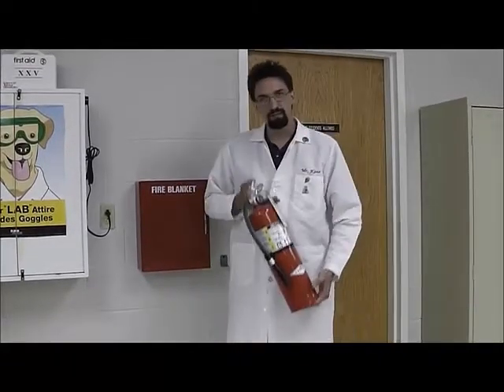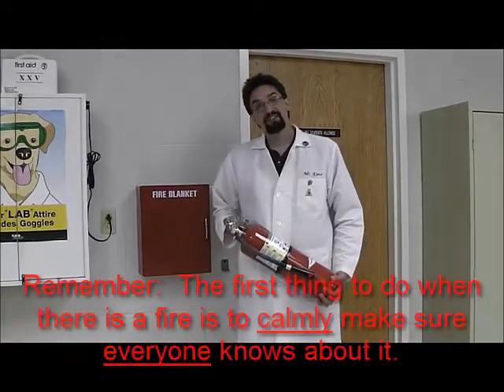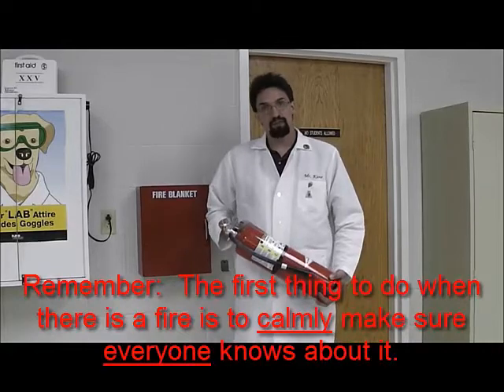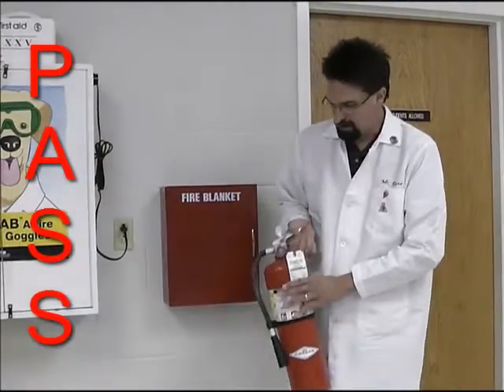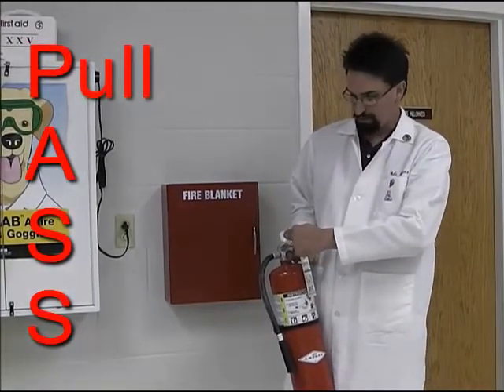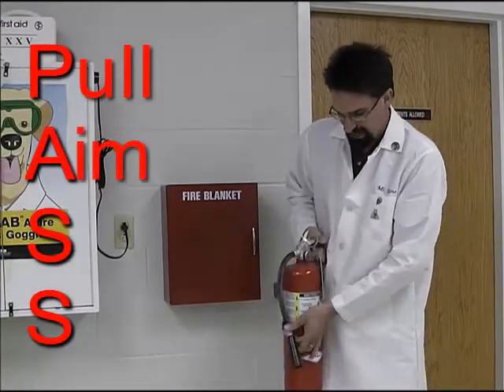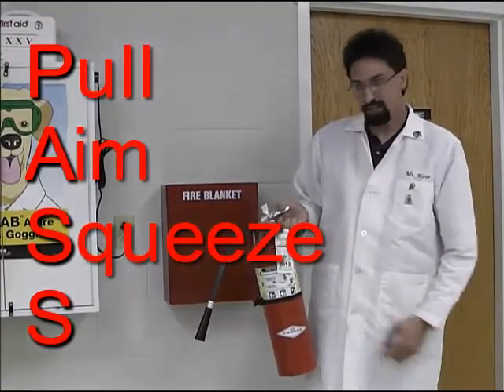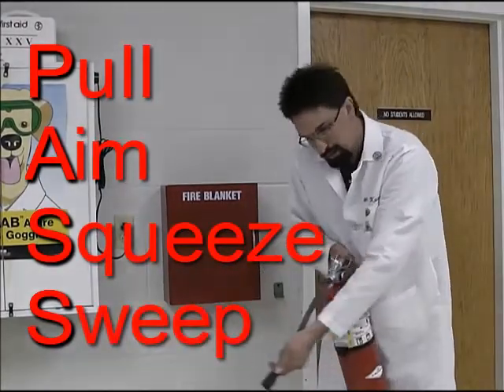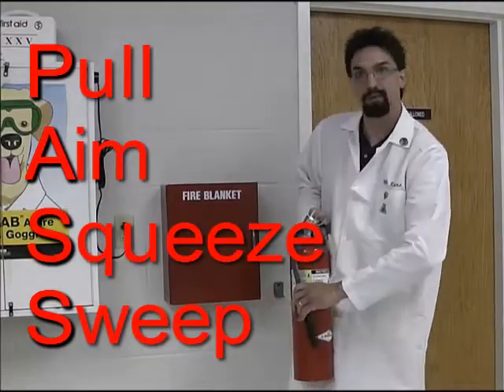You just pick it up and pull it. It is pretty heavy — probably about 15 pounds. If a fire starts in the lab, the best thing to do is first make sure that people know there is a fire, and then one person should walk to get the fire extinguisher. Typically that will be a teacher, but if the teacher is not available, it might wind up being a student. To use a fire extinguisher, remember the simple acronym PASS — P-A-S-S. The P stands for pull — you pull the pin. A stands for aim — you aim the hose at the base of the fire. S is for squeeze — the handle needs to get squeezed as you are aiming. And the final S is for sweep — you sweep the spray back and forth, and that will help you put out the fire.